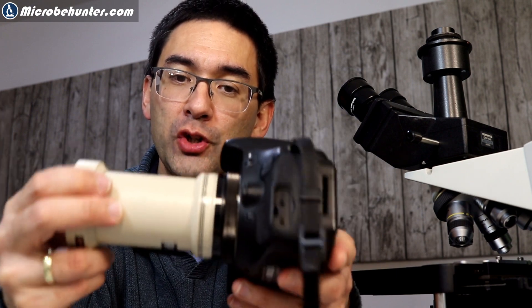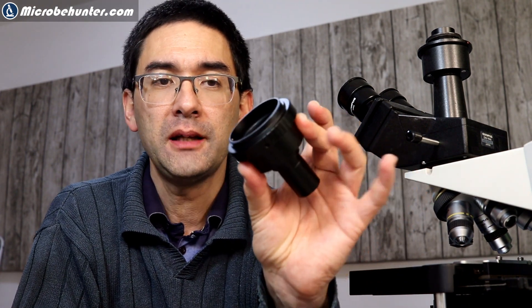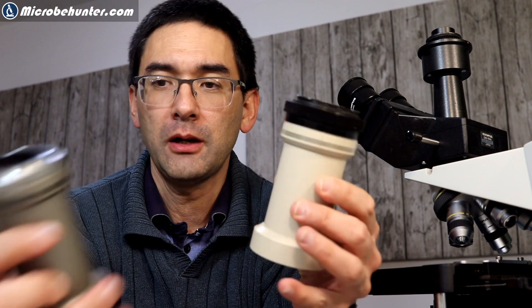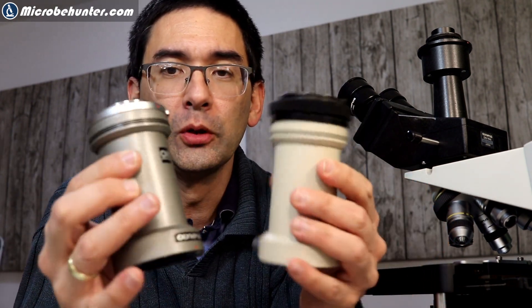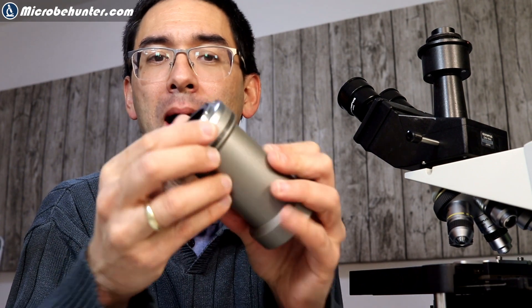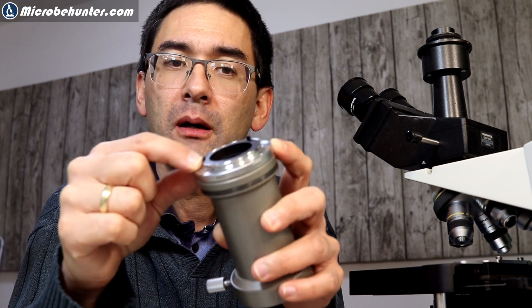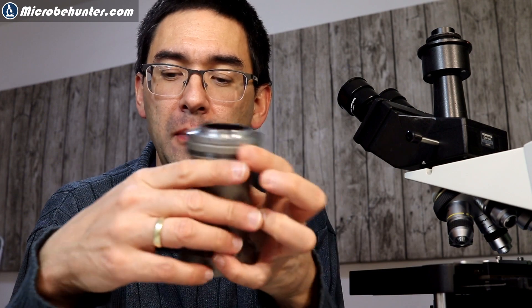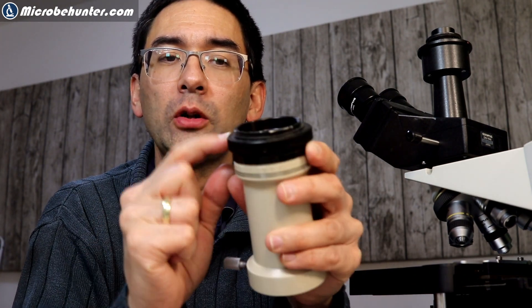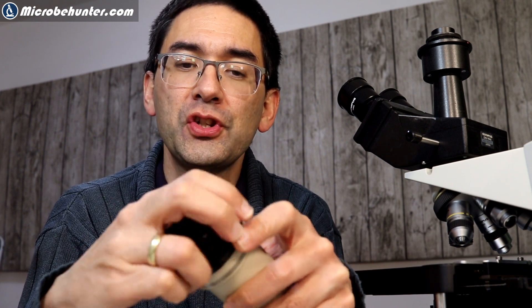I just want to talk about this briefly. It does not only apply to big original adapters from Olympus like I have here, but the rule also applies to smaller adapters like this one. What I specifically want to show you is that these two adapters, even though they look very similar and are almost the same — both from Olympus — there is an important difference. This one has an Olympus OM mount already screwed on, so I can only connect an Olympus camera here, and there is no possibility to take this off.